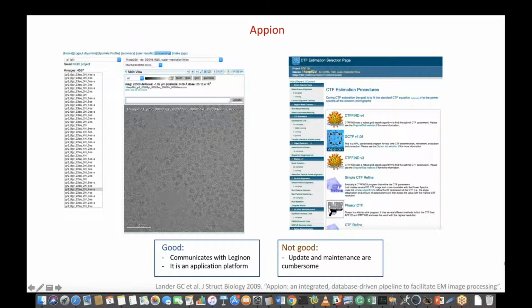Okay. So what is also interesting, as you see here, you have all the micrographs. You can see the unaligned micrographs, which is missing the A, and the aligned micrographs. And then you can delete them, or as you see here, you can delete to trash, or you can hide the micrographs you want. So it's great. In general, when you're collecting data, you have very bad micrographs, and that's a way that I like a lot to exclude the bad ones.